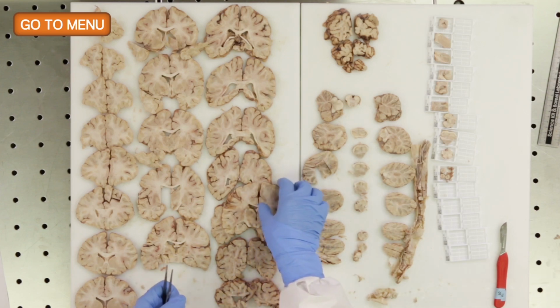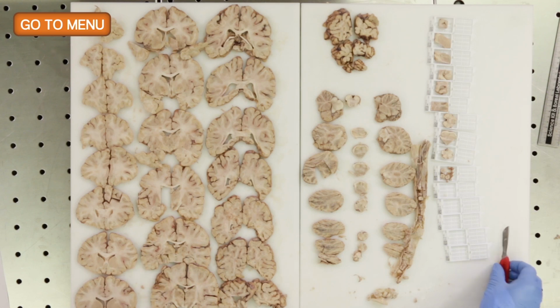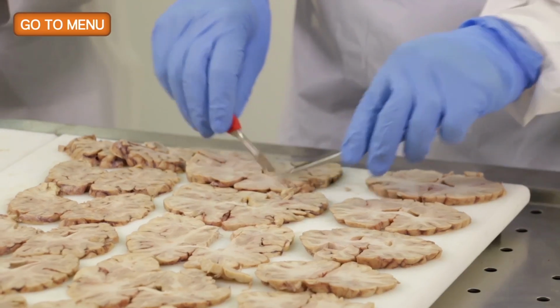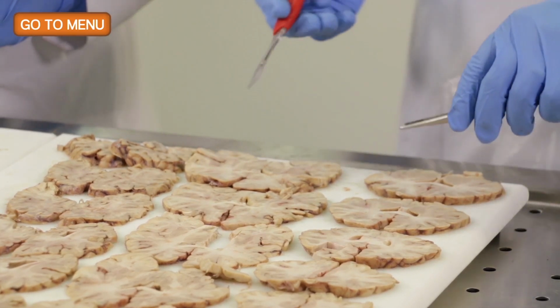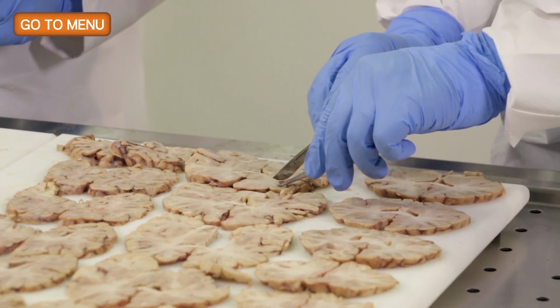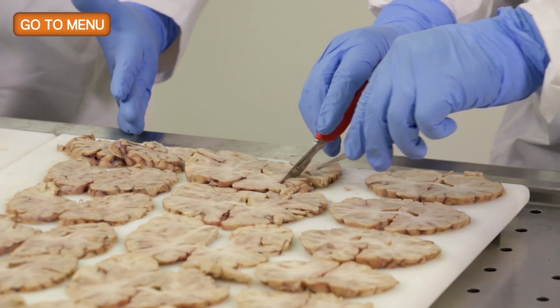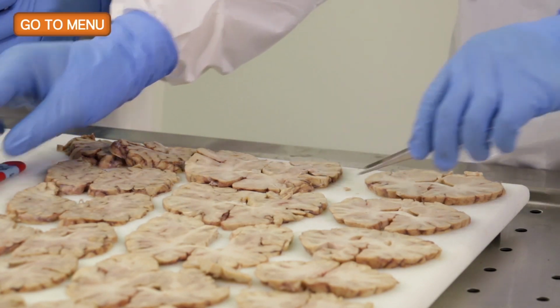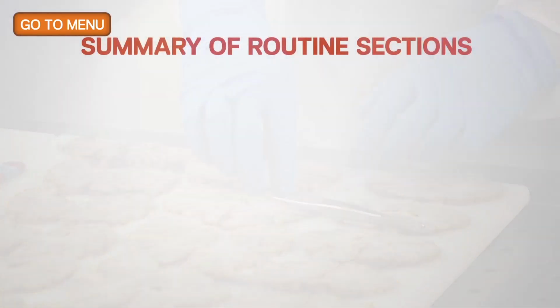And just like when you're grossing any other specimen, it's helpful, if possible, when you are sampling a lesion, to sample the interface of the lesion with nearby more normal looking tissue. And oftentimes it's that transition zone that can tell you a lot about the pathology. You don't necessarily want to sample just the center of a necrotic area, that oftentimes will not tell you everything you need to know about the lesion microscopically.